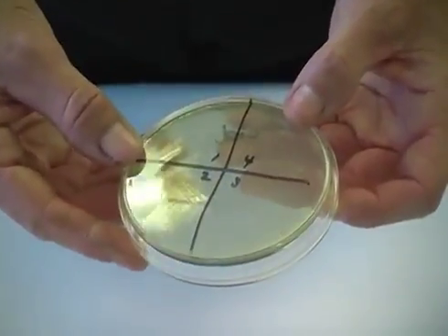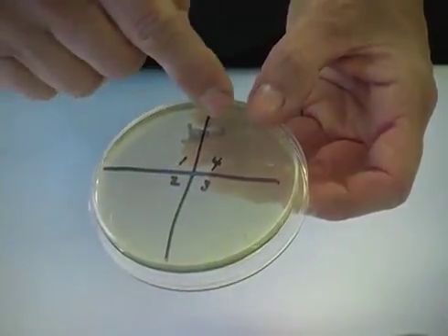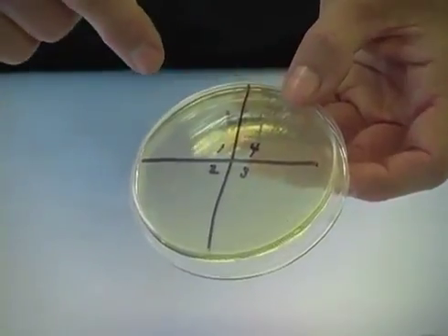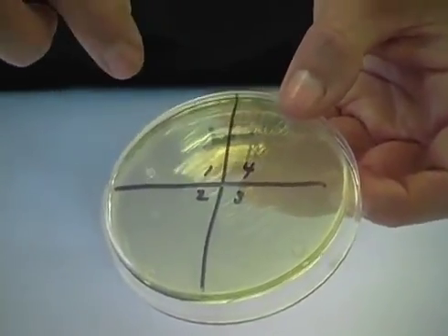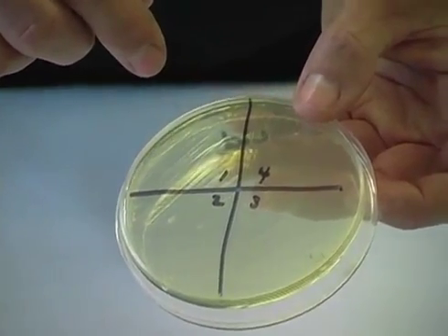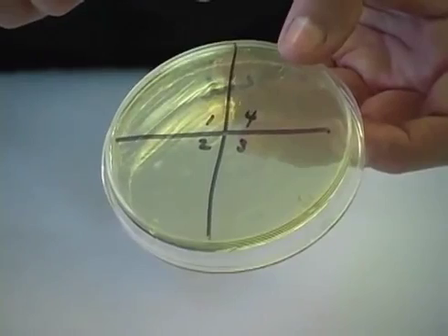When we're first learning to streak our plate, often it's helpful to draw quadrants on the bottom of the plate. Have quadrant 1, quadrant 2, quadrant 3, and quadrant 4. This will help us spread our microbes over the correct quadrant and will prevent confusion during the streaking process.